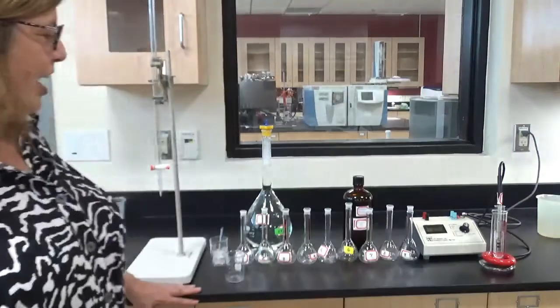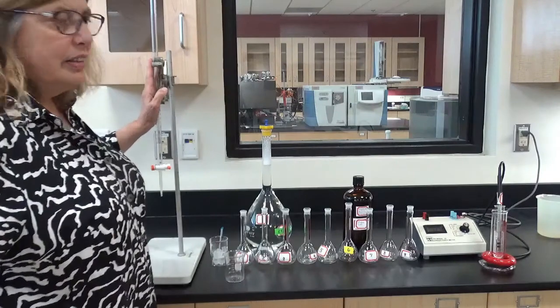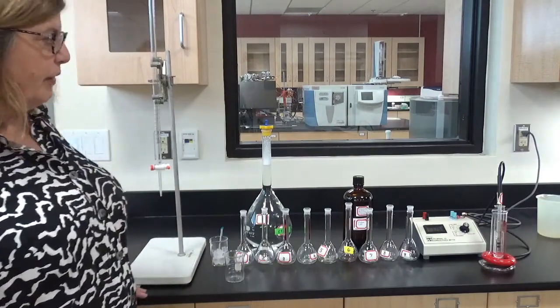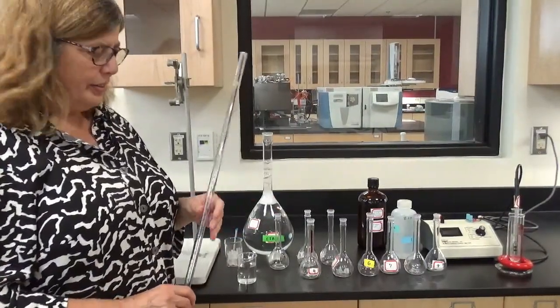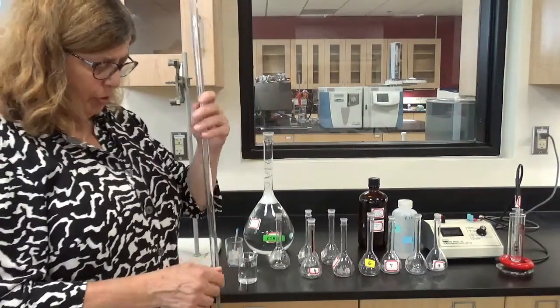What I'm going to do first, I'm going to rinse all these flasks with the DI water. I'm going to put the appropriate amount of stock solution, which I'm going to do by burette, and I'm going to make all 9 solutions. And of course I have to put 4 milliliters of the phenanthridine in each one as well. All right, so I rinsed all my flasks with DI water, as well as this burette here.